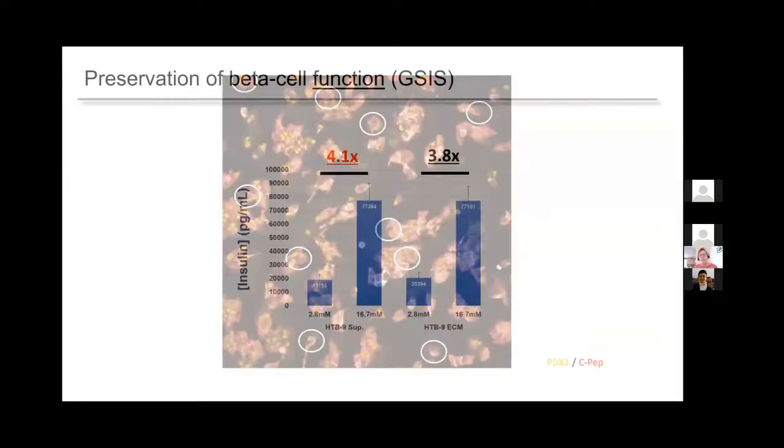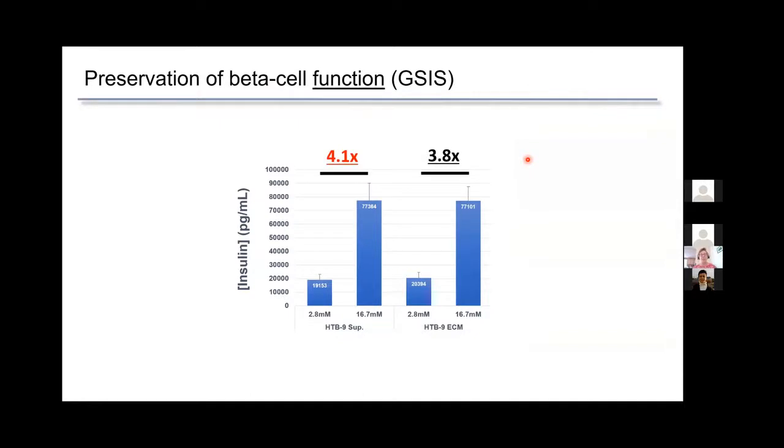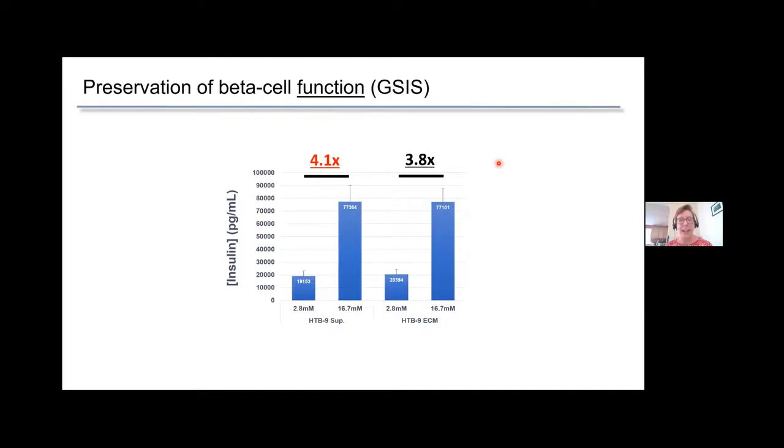So that's it for proliferation. We've now performed actually a screen of 10,000 compounds, and we're following up on some hits, and that's really exciting. And we hope to get new targets. I know that many of us in the field have been trying to find compounds to promote proliferation, and many times it all comes back to DYRK1A, which is a kinase that when inhibited can promote proliferation. Happy to say we found at least one compound that is not targeting DYRK1A, so I hope to have an update for you in the near future on its mechanism of action as well.